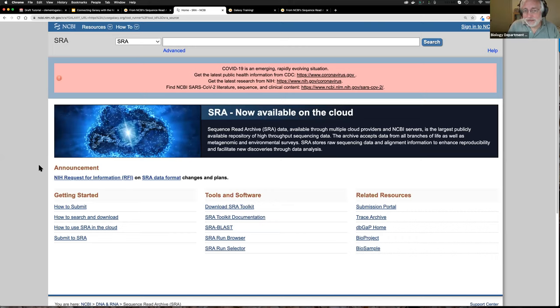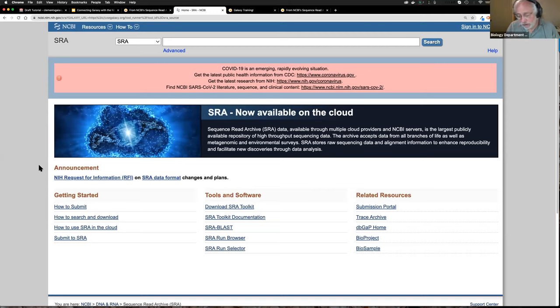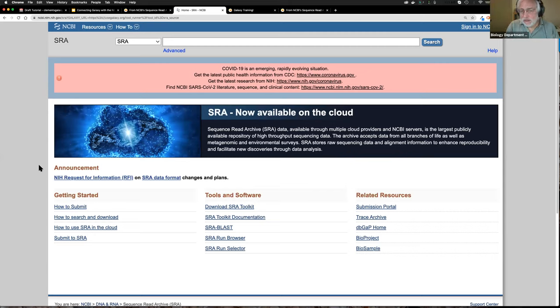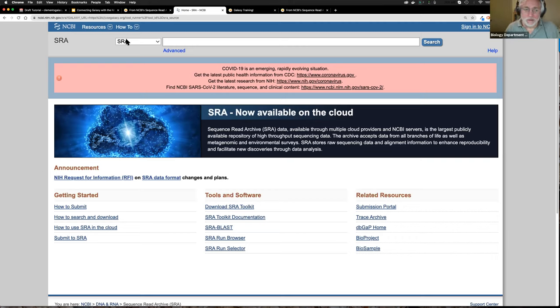This feature is currently available on usegalaxy.org. Support is in the 20.05 release, which is imminent, and once released it will filter out to other Galaxy servers. Behind the scenes, when I clicked 'go to the SRA server,' Galaxy goes to SRA and tells it which server it came from — SRA remembers that, and when I ship data back, it knows which server to send it to.